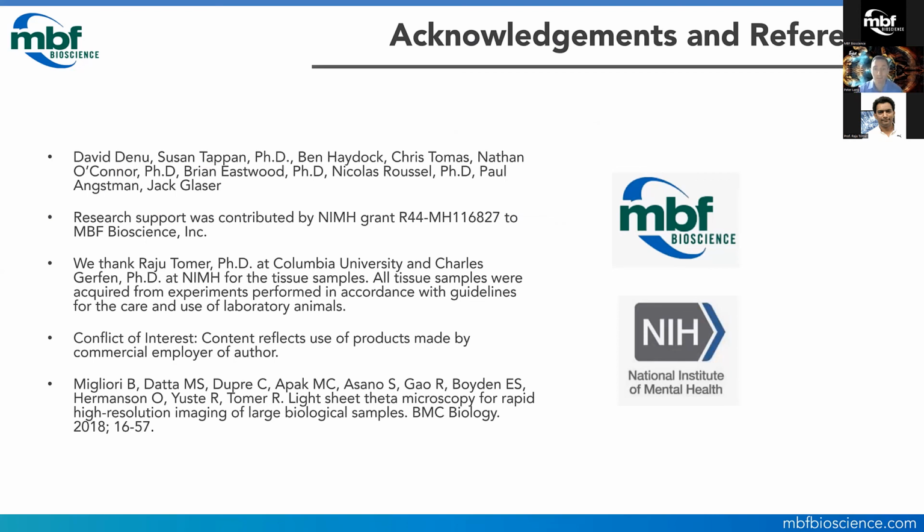Oh, sure, absolutely. In our custom light sheet theta system, we had the capability of live imaging, which is essentially easy to add, right? We just repeat the experiment again and again. In terms of the advantage of the microscopy for live imaging, let's say live mouse embryos, I feel it's a very good system to do that, especially since mouse embryos are not transparent like zebrafish larvae or even Drosophila embryos, which are still accessible. So mouse embryos present their own challenges, and if you can manage to image not from one side, but with the light sheet theta, then it can provide advantages.